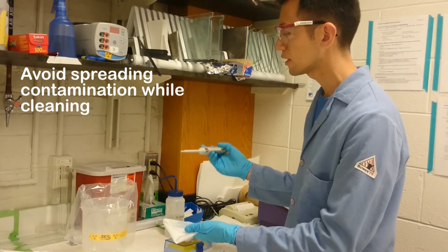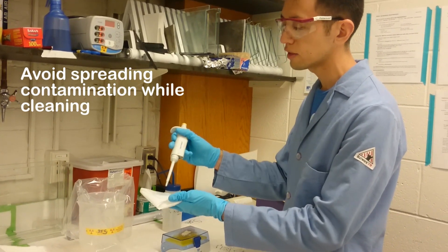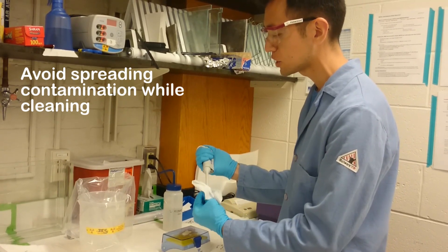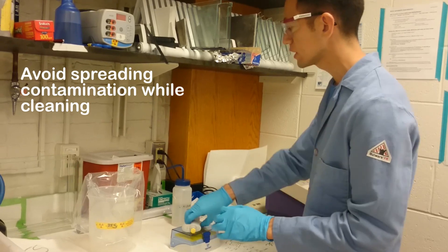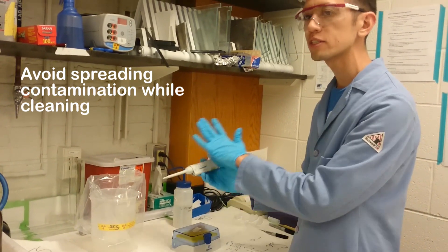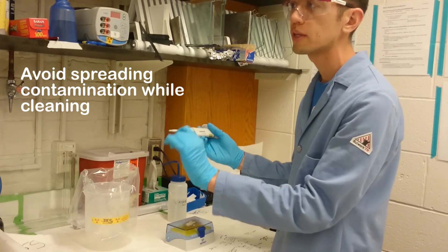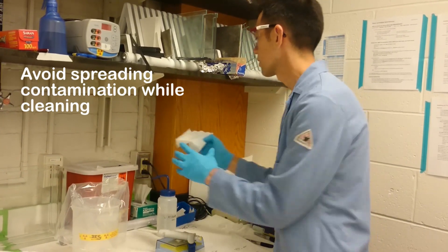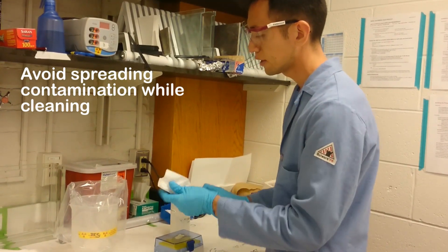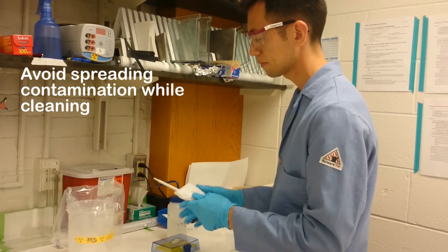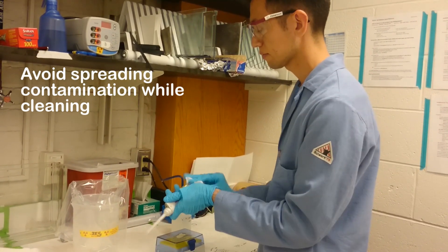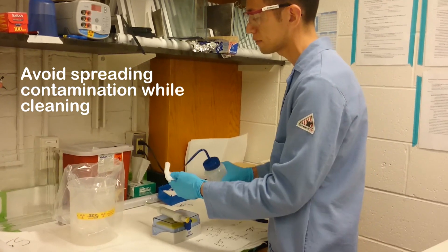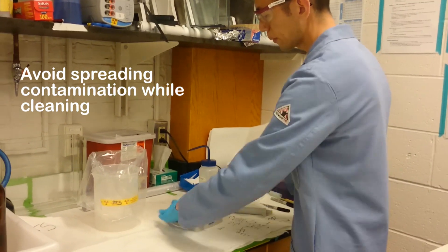You start by getting a Kim Wipe wet and you want to clean the business end of the pipettor first. Make sure that you change wipes because this is most likely to be contaminated and the rest of it should be less so. You don't want to clean this and then bring contamination to the rest of the pipettor. So I clean the front, I'll clean the body, and at the same time I'm also going to clean the pipette tip box.